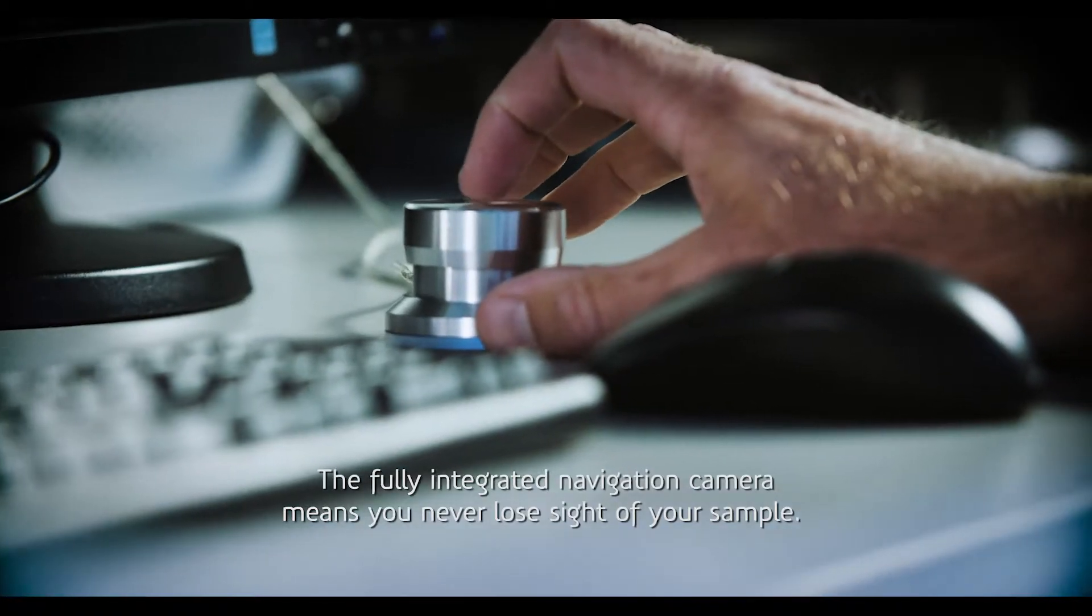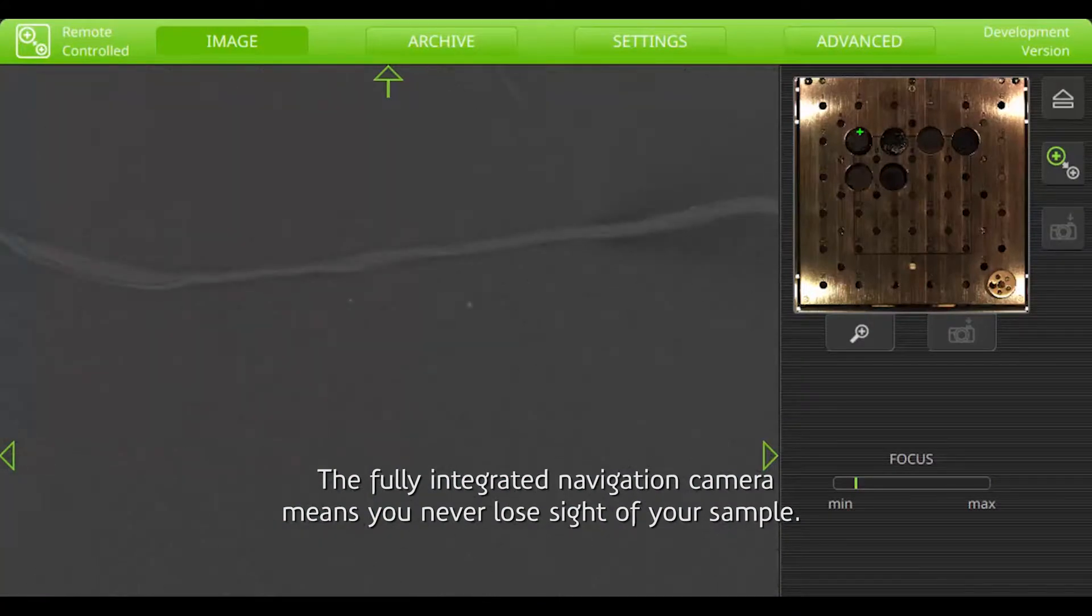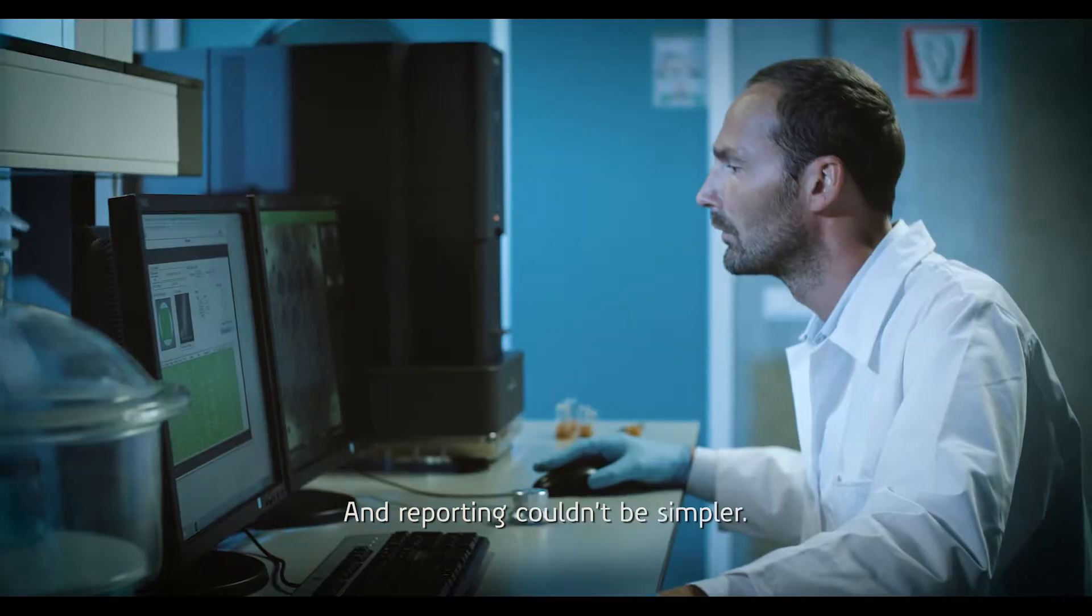The fully integrated navigation camera means you never lose sight of your sample. And reporting couldn't be simpler.